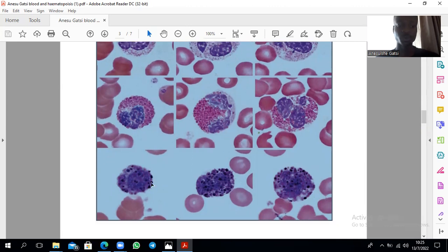Then these are your basophils. Right? They are almost the same size as your neutrophils. They are named basophils due to the presence of the large granules that you see there, which give the cell a highly basophilic appearance. Right, so these are your basophils. And for your white blood cells, these are going to be the least abundant. Remember I said the neutrophils were going to be the most abundant. These are going to be the least abundant.